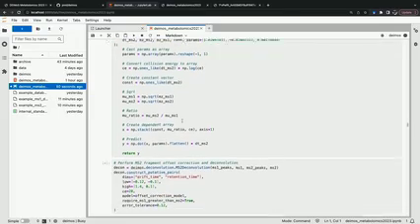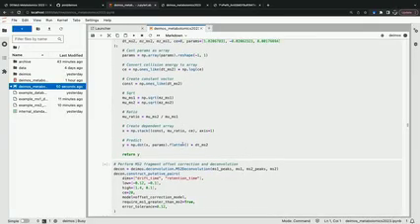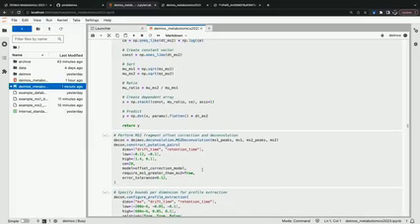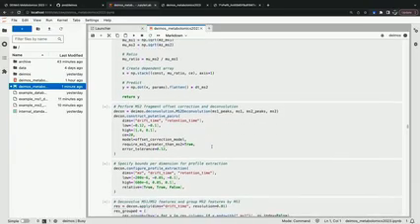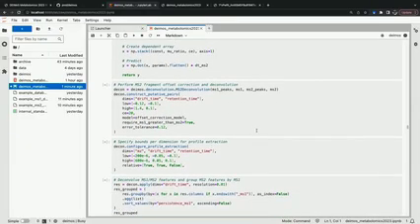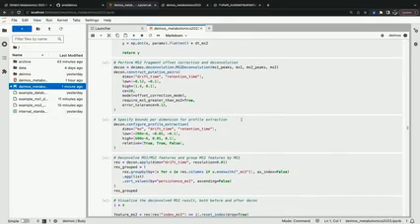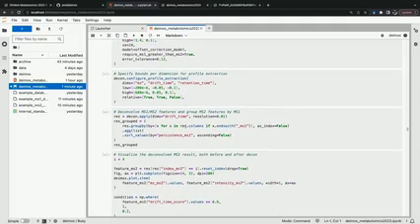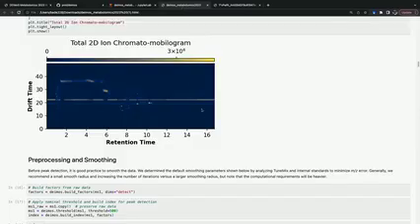And then once you apply that offset, now you can better associate those fragments with the precursor peak, and then from there, DEIMoS can then perform deconvolution, the process of associating those MS fragments to the precursor and producing the MS2 spectrum. And so the deconvolution step does take a bit of time, and so I'll run through the example on the HTML while the notebook is running.